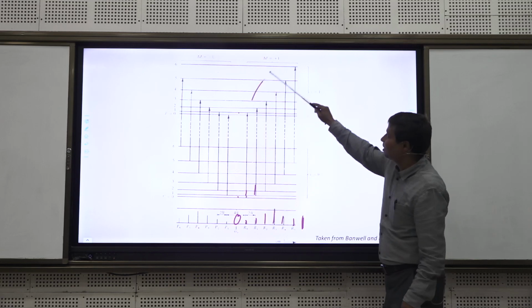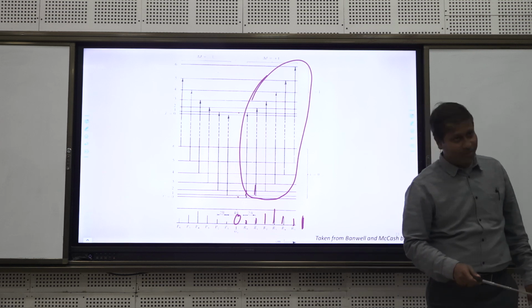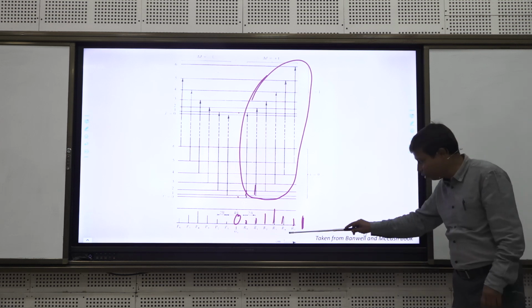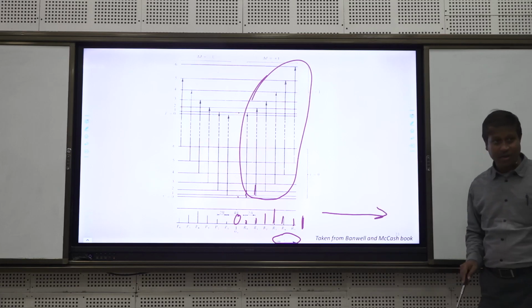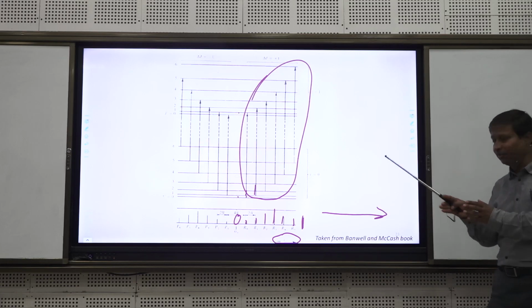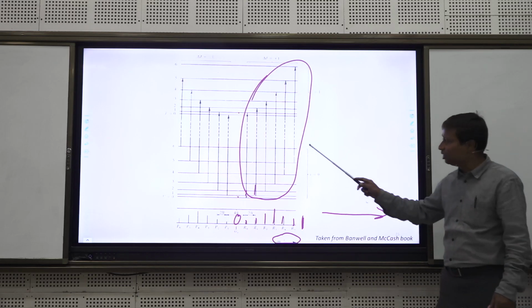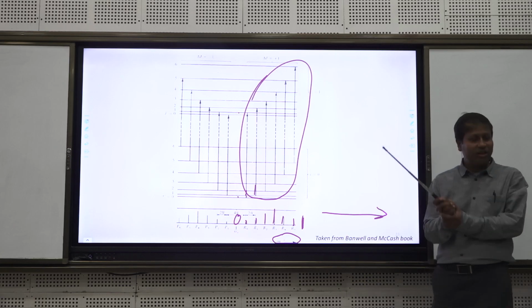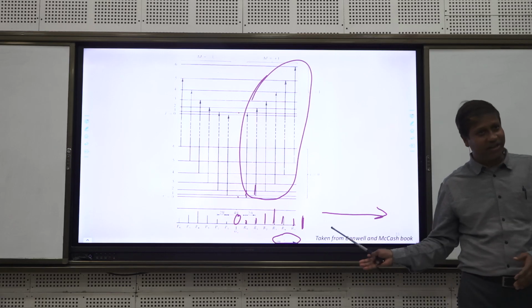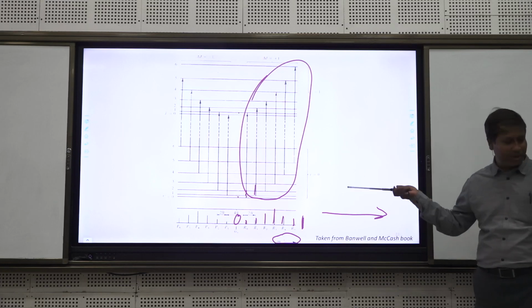This side of transitions is known as the R branch. If you follow this one, the energy level is going this way. If you think of it as going to the right-hand side, you can remember this branch as the R branch. Think of right side, R, provided you are plotting it this way.